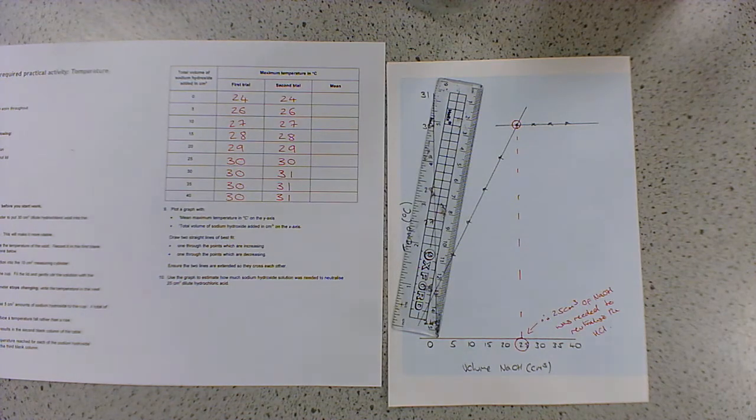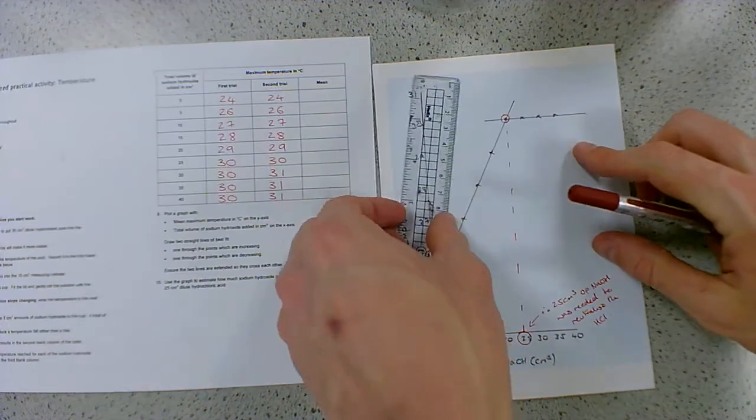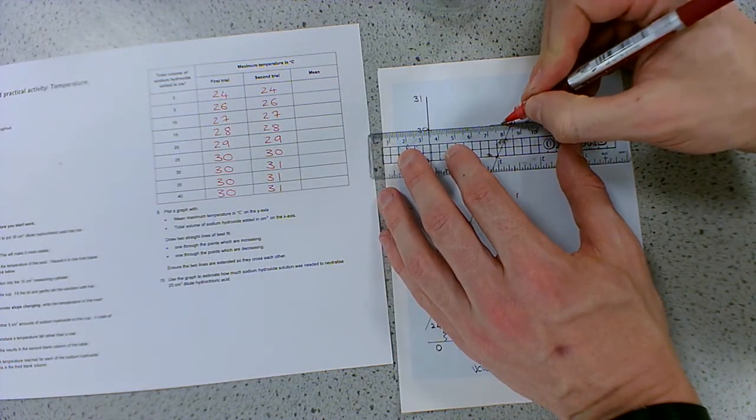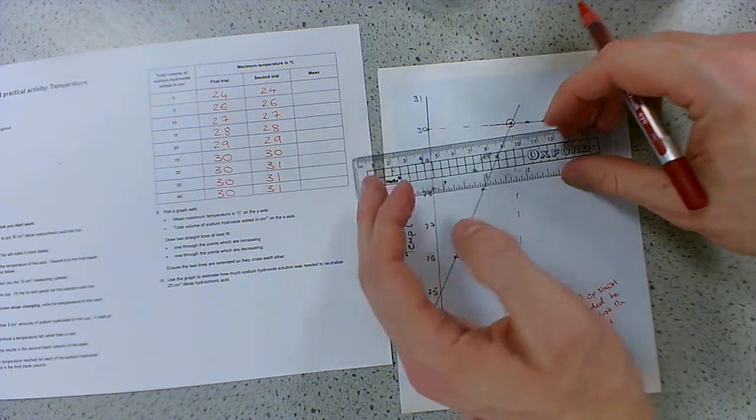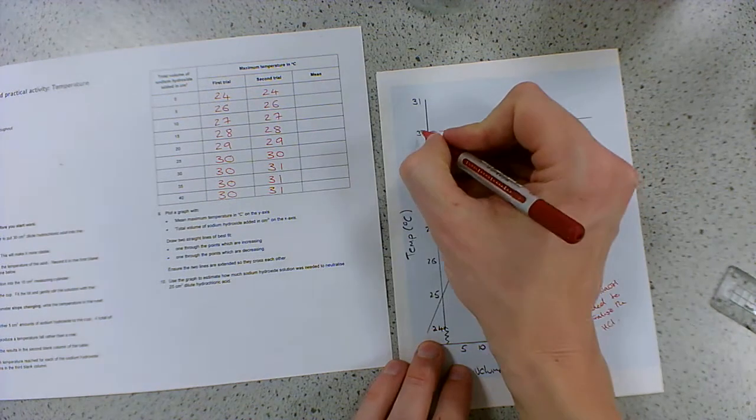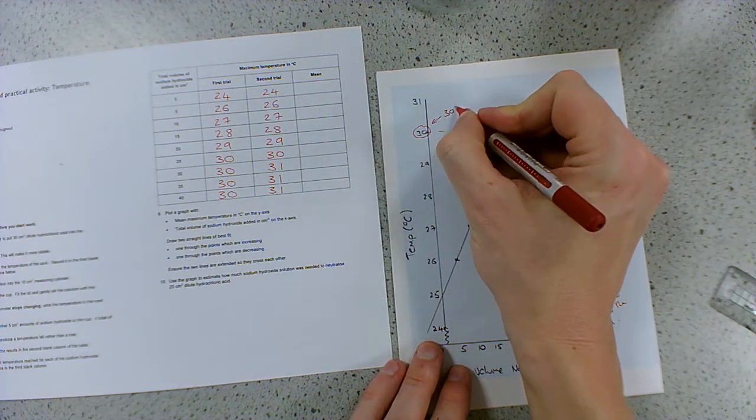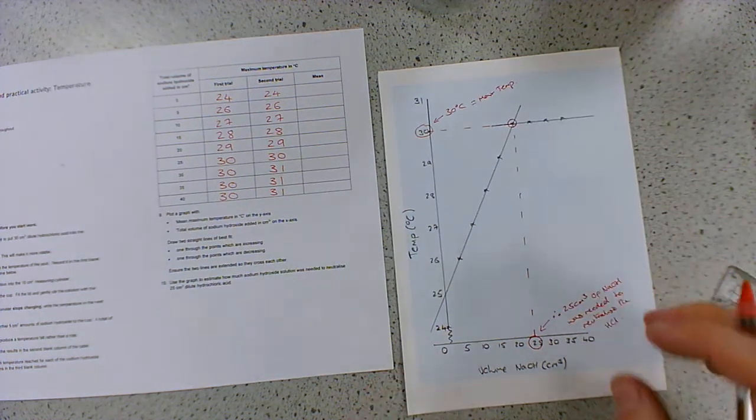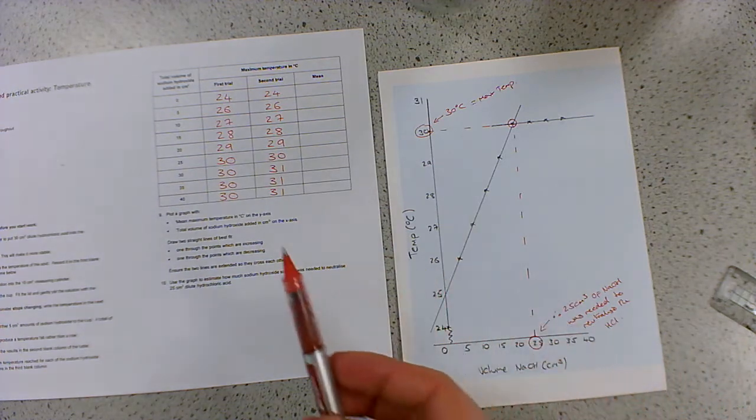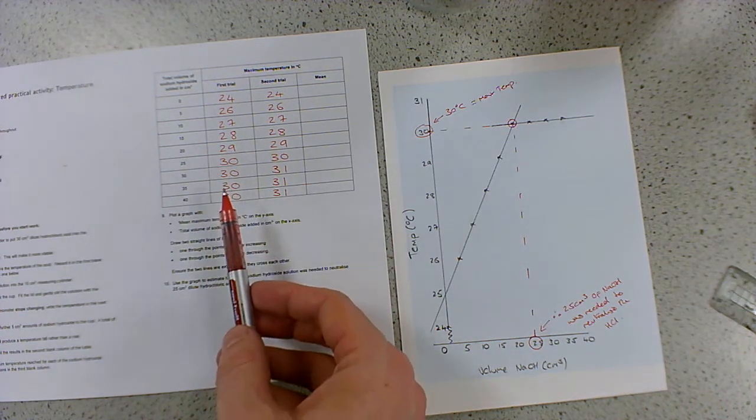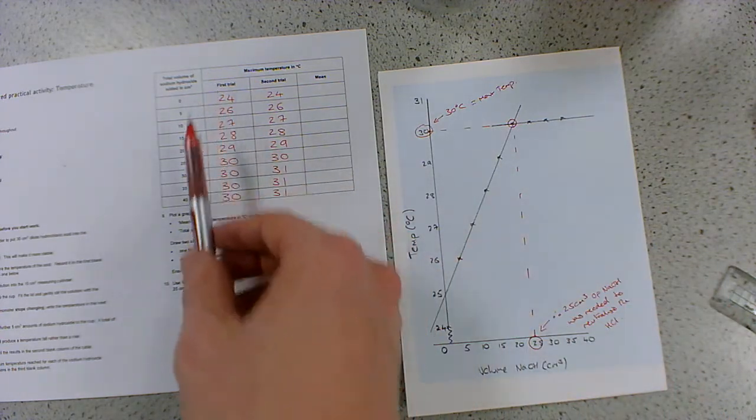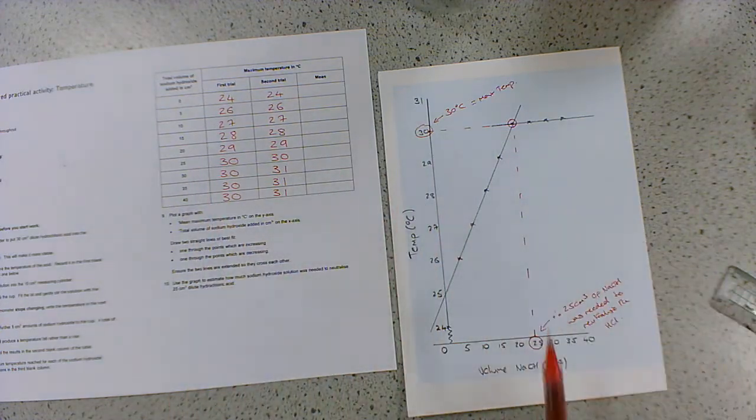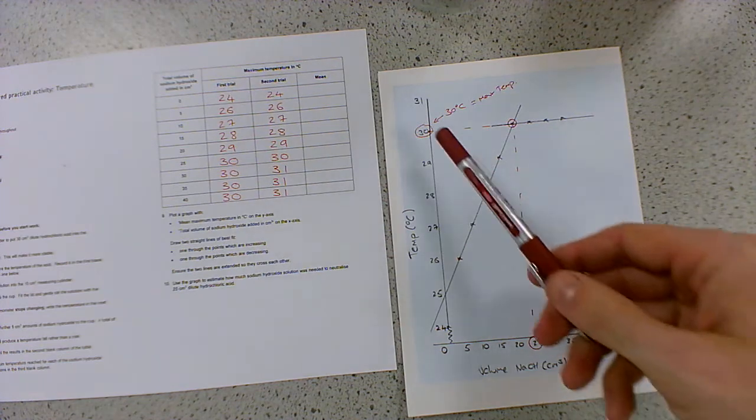Okay? The other thing we can get from the graph is we can actually work out what the maximum temperature change was. And that is just by doing the same thing and extrapolating across to the y-axis. In this case, the maximum temperature reached was 30 degrees. Now, again, we kind of already knew that because of the, from the experiment. Now, this data I've plotted here is just from trial one. Yours will be slightly different because you're plotting the average, okay? But if we were just plotting trial one, this is what it would look like.